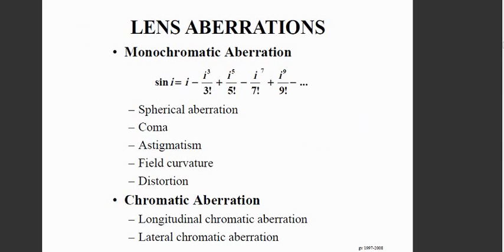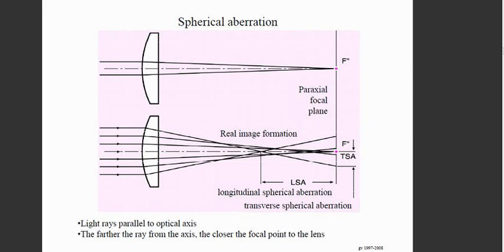So let's get started. The spherical aberrations. What's important to understand is that this is the optical axis, if you don't already know. And what you need to understand with the spherical aberration is that the key words here are rays entering the lens further away from the optical axis are refracted closer. And by saying refracted closer, they meet closer. This should clue you in that there is more than one focal point.